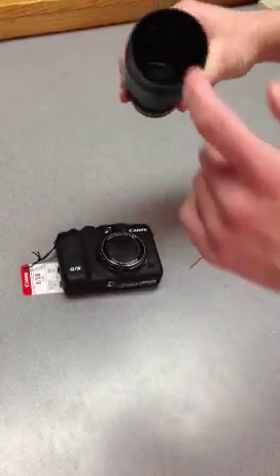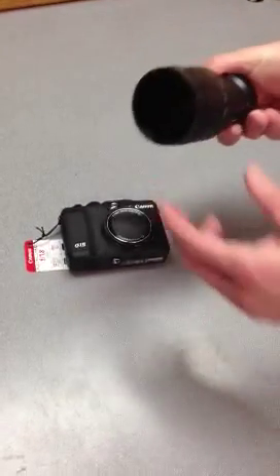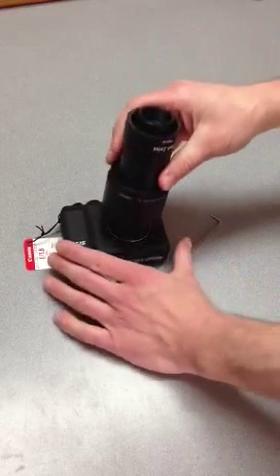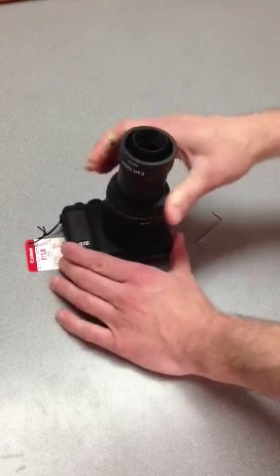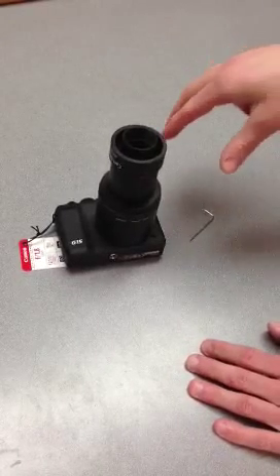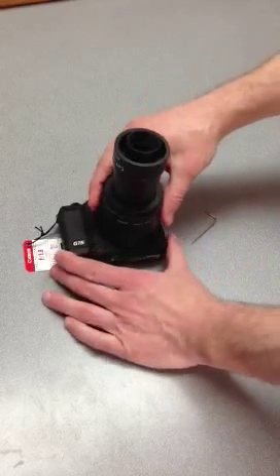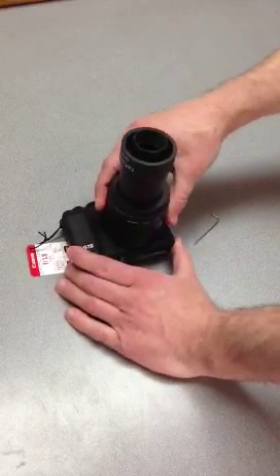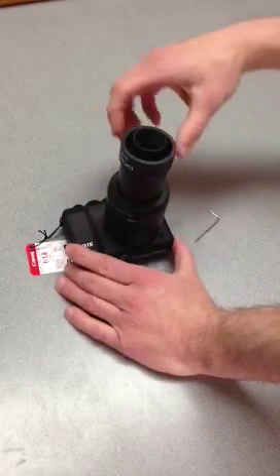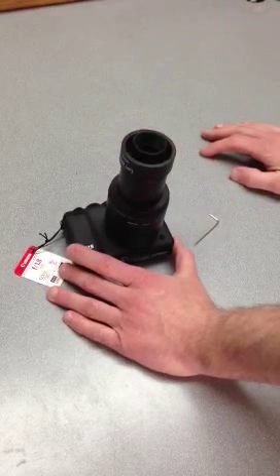Next, you take your adapter — this big hole here is just going to twist right onto the camera. So you put this down, twist it, and it'll click right onto the camera. If you have trouble, just start it at a couple different spots. You have to get it at the right spot, but it'll just twist and click right on there. It doesn't screw on and it doesn't require a lot of force — it just clicks right on.